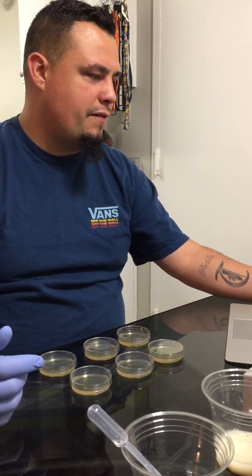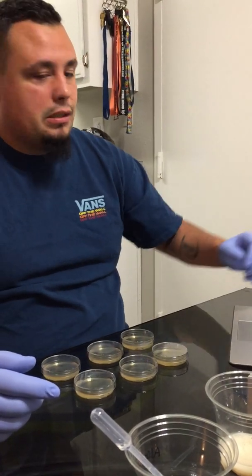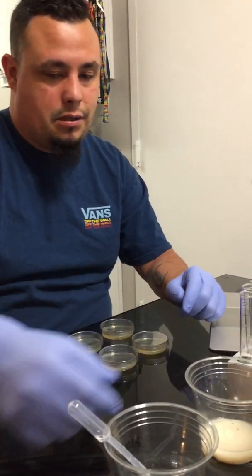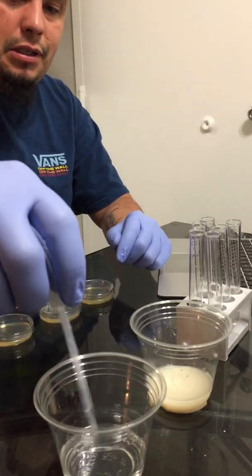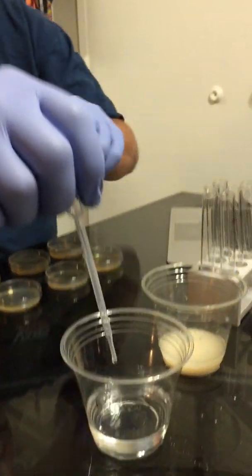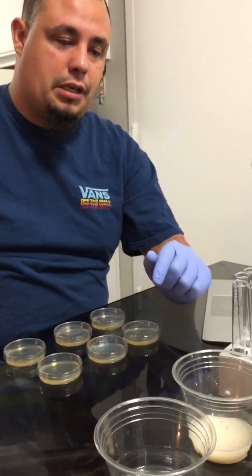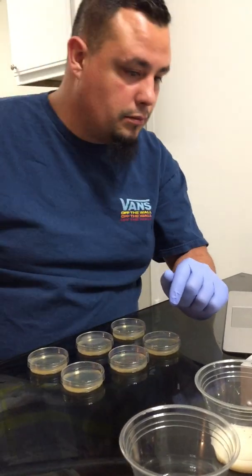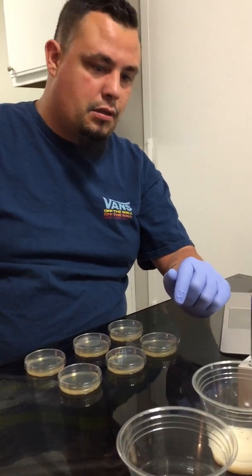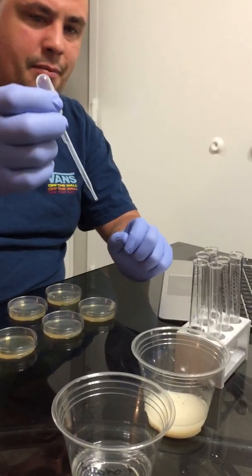So what we're going to do now is the transfer of the yeast into the test tubes. We're going to do it 1 through 6. We're just going to go over the process on video. So this is my alcohol, labeled alcohol there. I'm just going to get this nice and sterilized. Alright. And then what we're going to do is get 0.25 mLs.